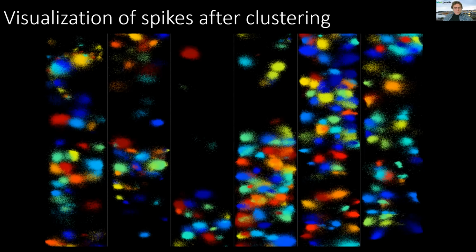All right, so I wanted to end on this picture of what's shown here: 6 segments of a NeuroPixels probe. This is a visualization you'll be able to do if you run Kilosort 3. Every cluster here that you see with its own color is one detected neuron. You can see the XY position for each one of these segments. So X position and Y position have been detected essentially using our new spike detector algorithm in Kilosort 2.5 that doesn't require spike sorting, but it can tell us where the spike is. The only information here after spike sorting is the color that I assign to each dot.